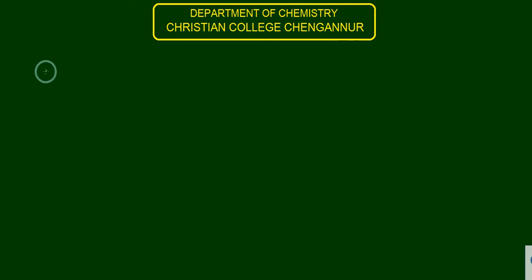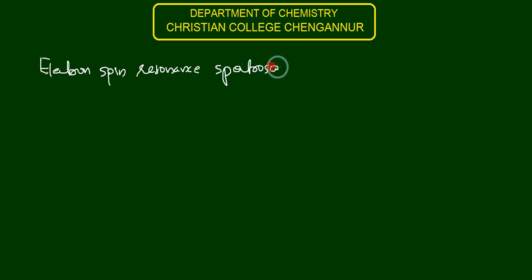Today we are going to learn an important spectroscopic technique, that is electron spin resonance spectroscopy, or ESR spectroscopy.